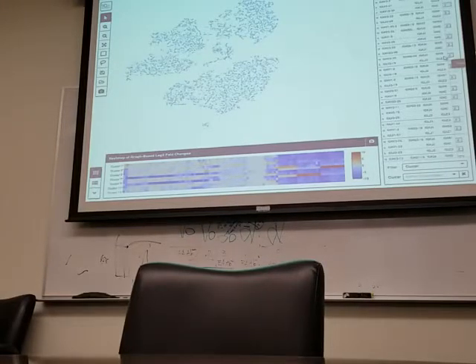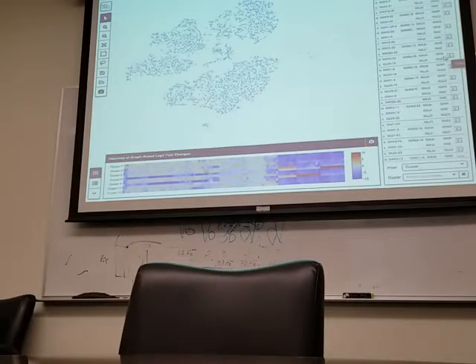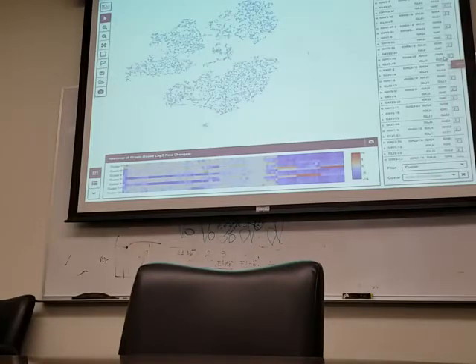165 has autoantibody, liver disease, and she has a lot of the type 1 signature genes, whereas the other two are really, in a way, very quiescent. Yeah. But if these sorts are very different from person to person, that's going to give you totally different results. So you can't really analyze these together.